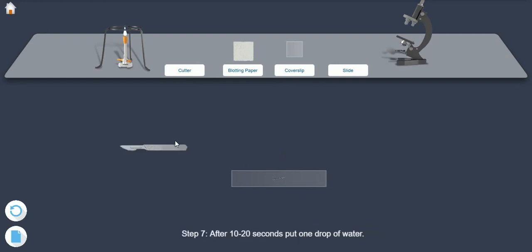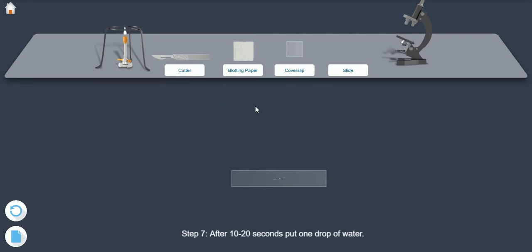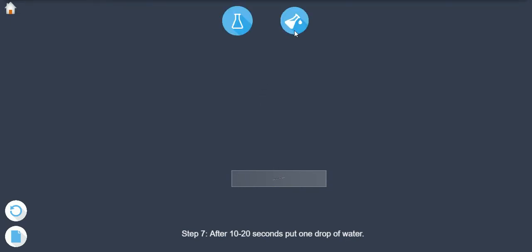Step 7. After 10 to 20 seconds, put one drop of water.